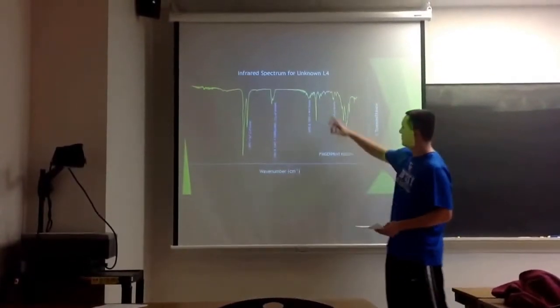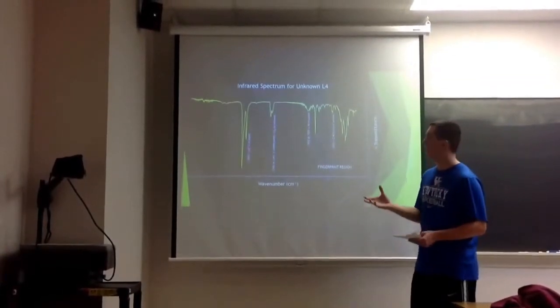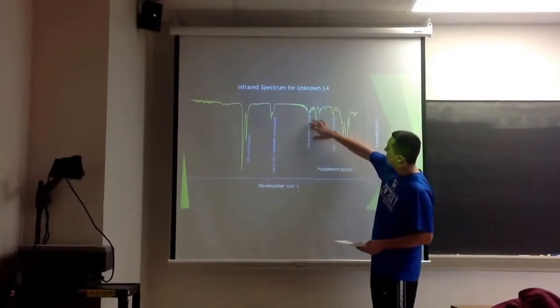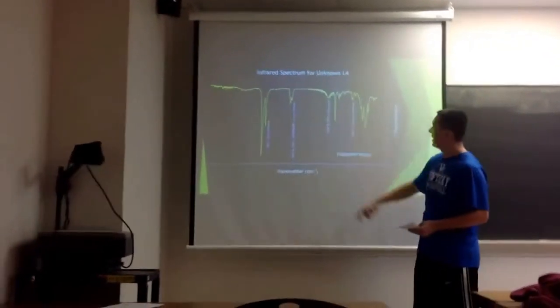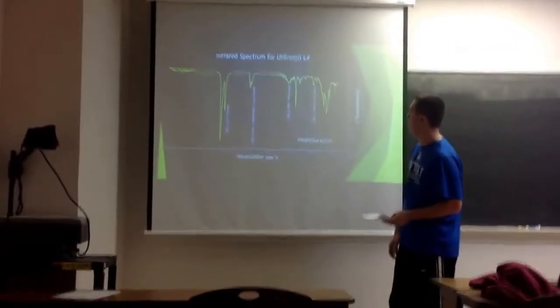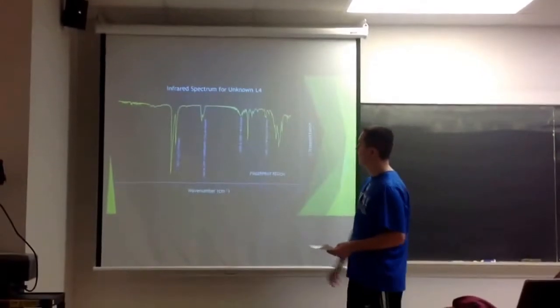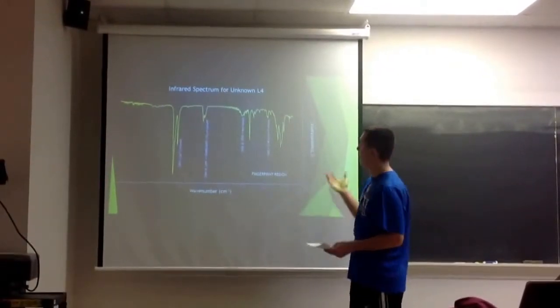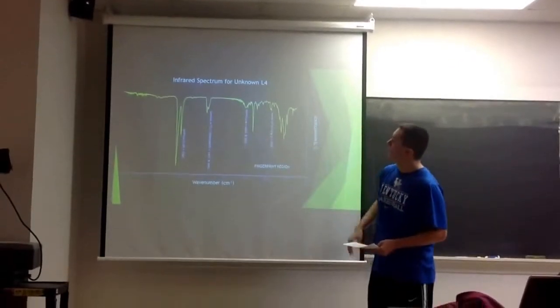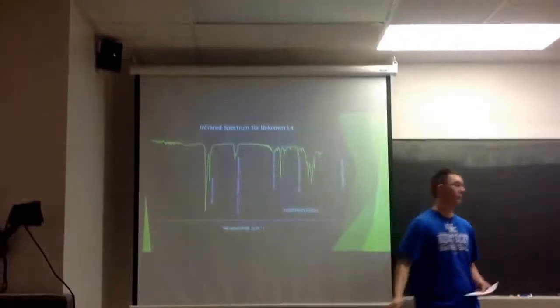Around here, this one was sort of difficult to see, but by looking at the other molecules and their functional groups, this peak leads me to believe that it could be an NH. Then I went further into the fingerprint region, even though it's not a major peak, and diagnosed this peak around 1009 to be a CN bond of an amine, and this one right here is an NH. Those 2 peaks are NH bonds. That's what I came to conclude.